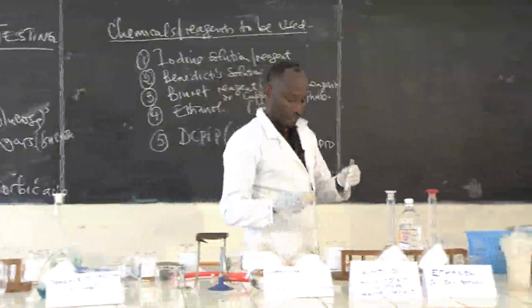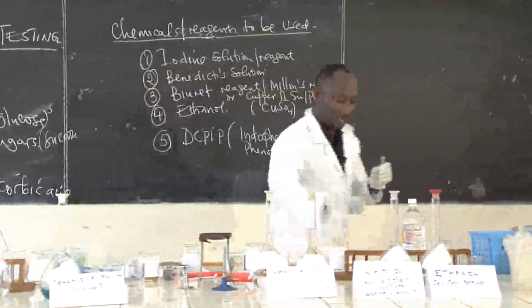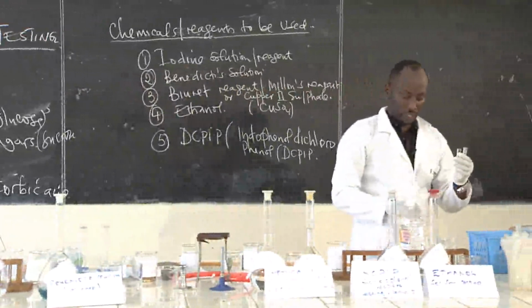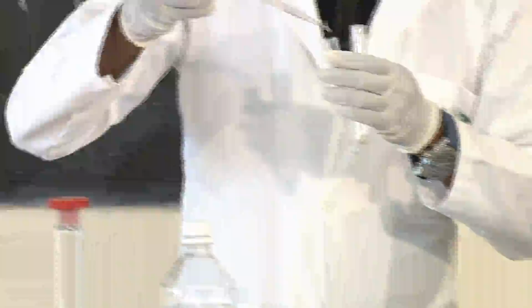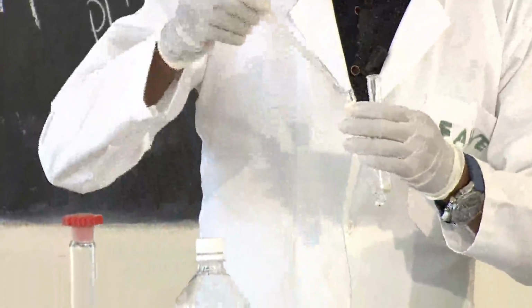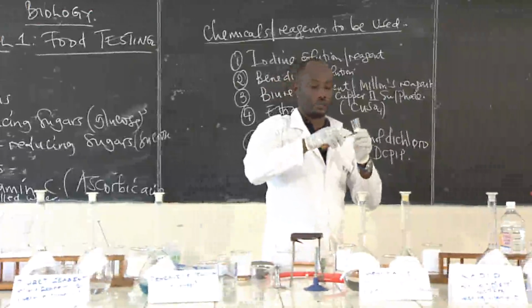From here, I'm going to put there the iodine solution. Let me first get another test tube and put there the distilled water, to act as a control experiment. Do the sweet potato contain starch? Now, I will make it, you observe it and tell me if this one is acting as a control experiment.